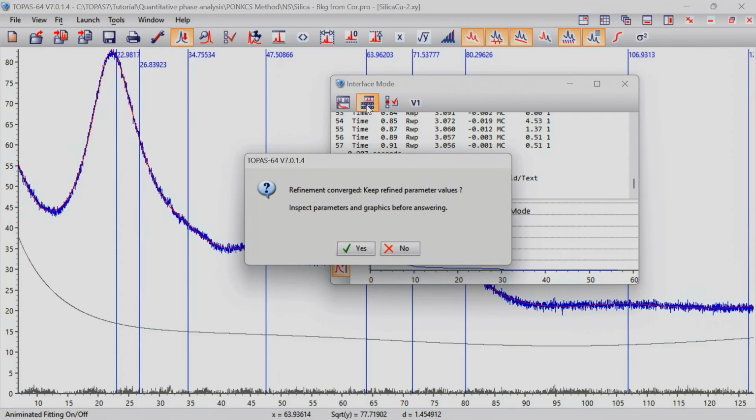So if you have no structure, and you do not necessarily need the structure, like in this case here, what is important for you is some way of describing the envelope. The envelope is what the Rietveld method would calculate from the crystal structure as the calculated data. Where the information comes from, at the end of the day, doesn't matter. It is least squares fitting of a calculated function to an observed data set, right?